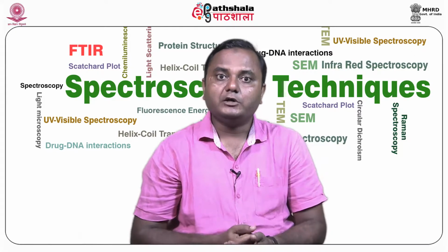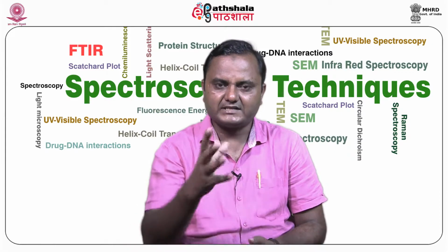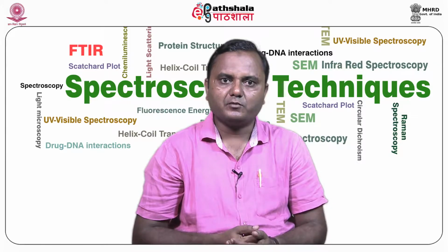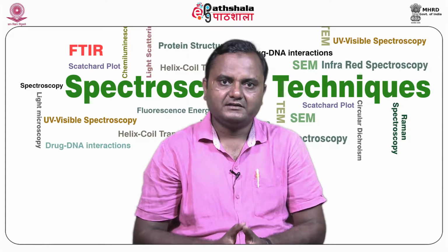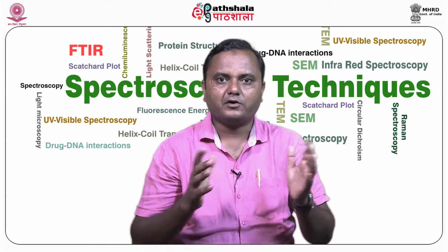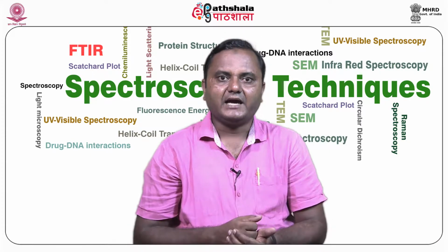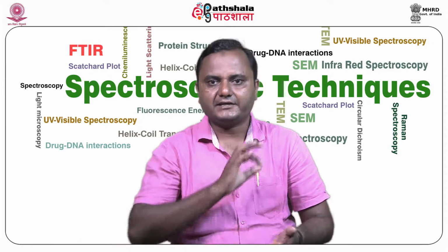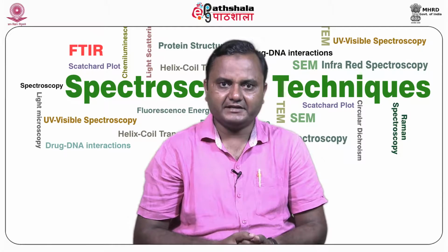Now, we will talk about the low angle light scattering, which measures at the lowest angle possible, and it is used for the measurement of molecular weight for all molecules with the highest accuracy. It has a low volume flow cell, but cannot measure the Rg value. Simply, light from the laser enters at the end of the cell and is collected through the same exit window at a low angle, that is 7 degrees.